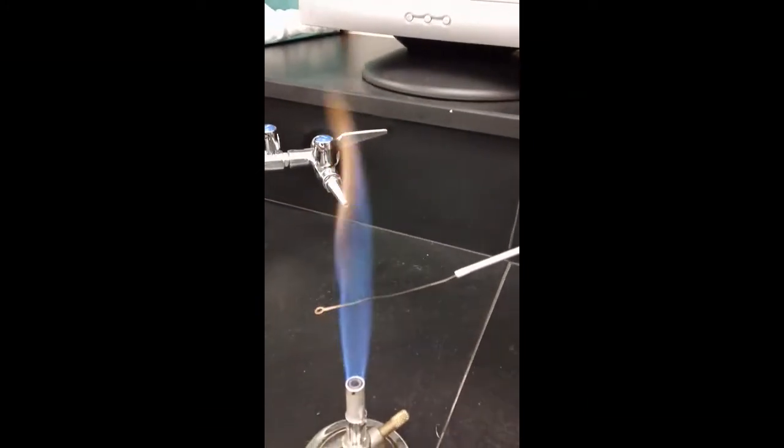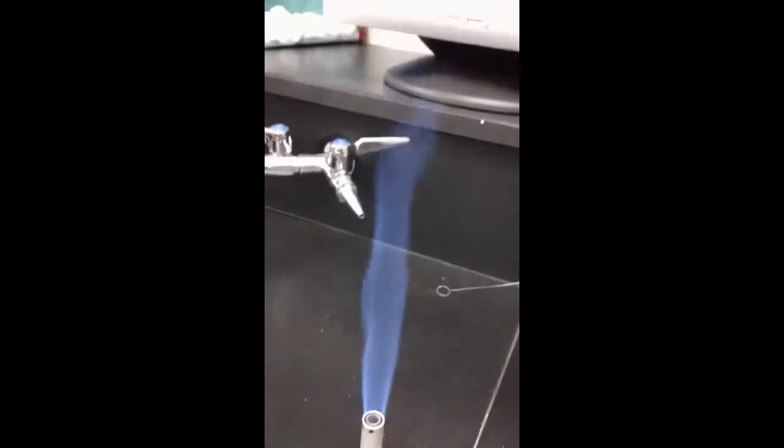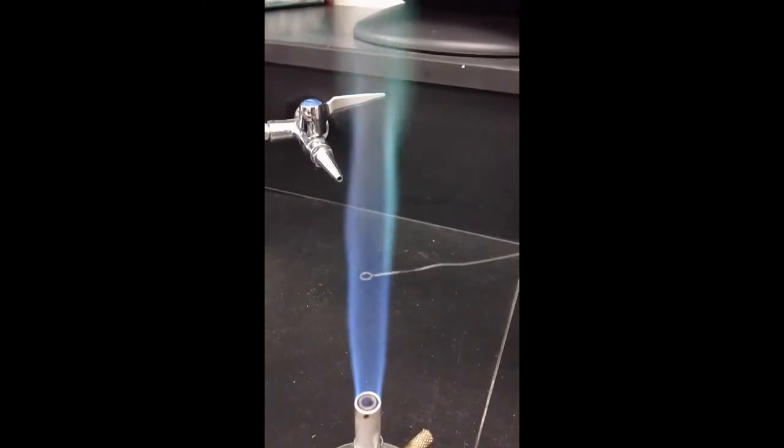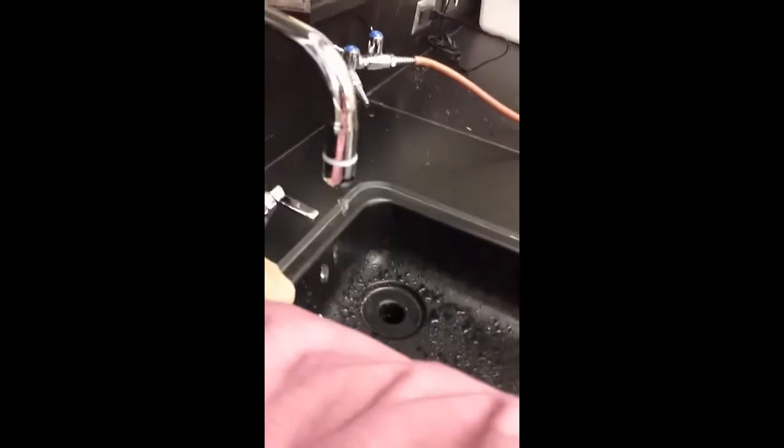Oh, nice and obvious there. Do you see that? Full green. Okay, I'm going to do it one more time. Put it in there. Do it one more time here. Okay, make sure you're writing down your observations. That was CU test A. Rinse one more time.